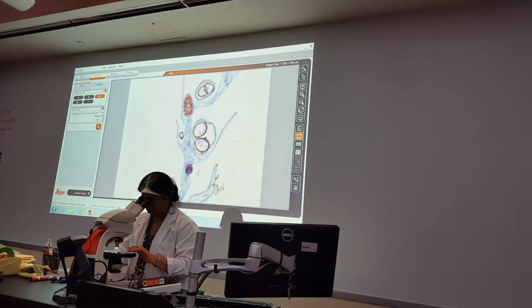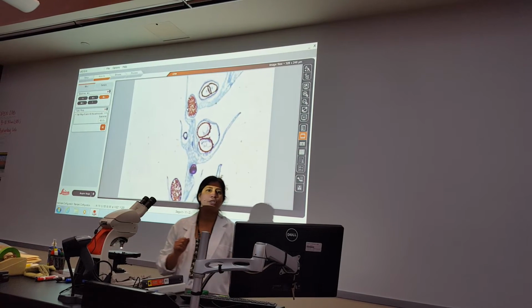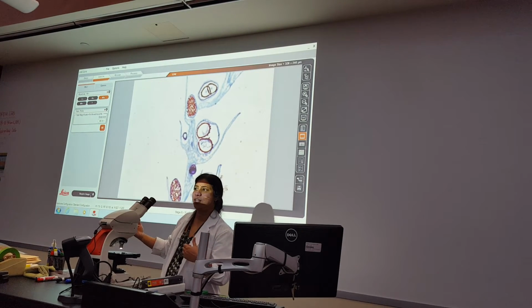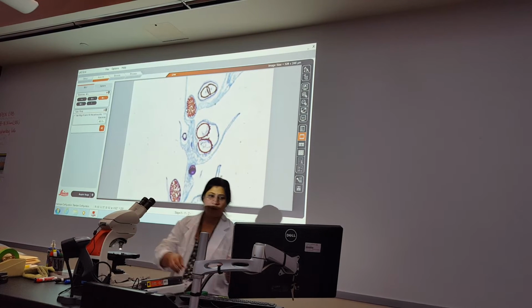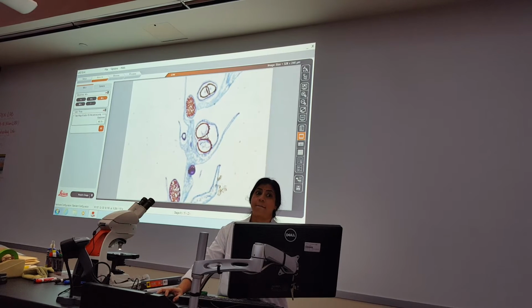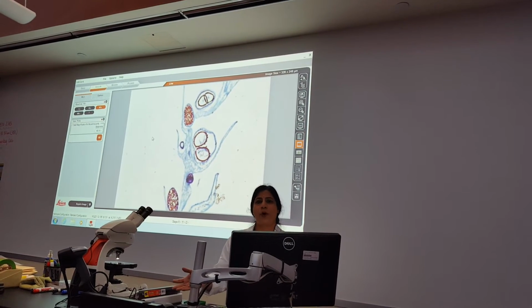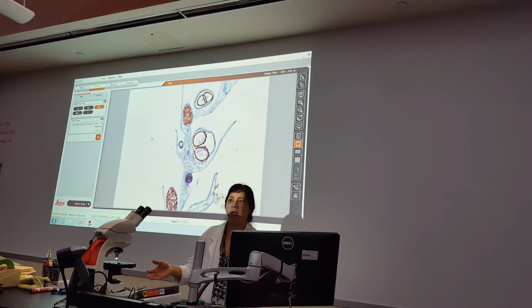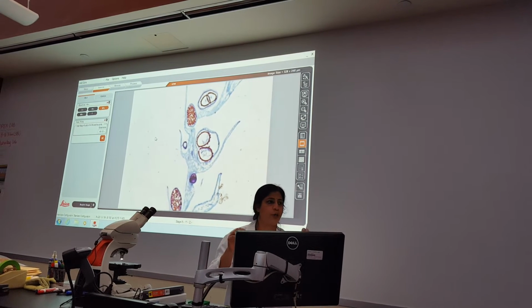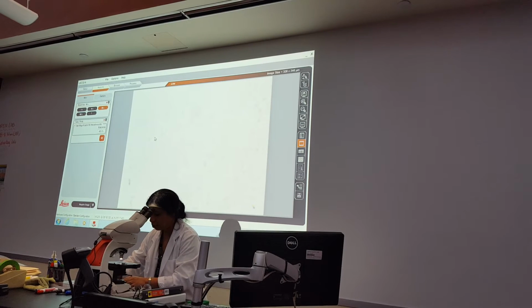Okay, look at this. Homosporous or heterosporous? Heterosporous. So what was the only plant where you saw a clear heterospory like this? In Selaginella. You cannot mix up. So if I point to this, what spore is this? The megaspore. What spores are these? Microspores. Again, what can I ask you? Haploid or diploid? That's a common question that comes through. If you can identify it's a spore, you will call it haploid. Are we good with this? Let's do the next one.